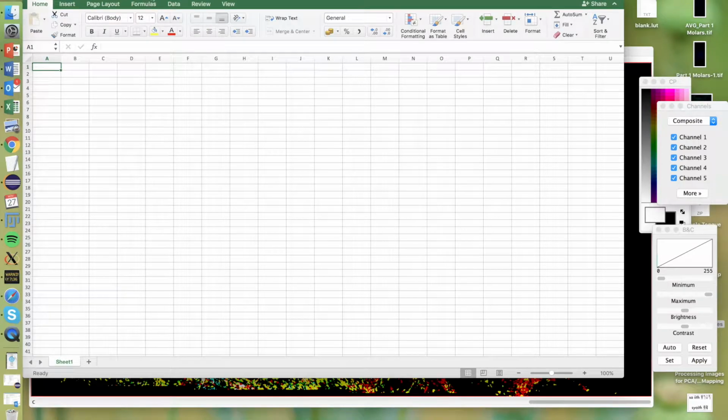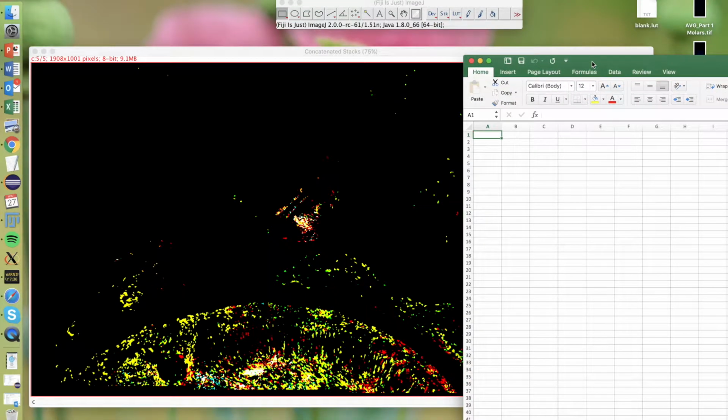and it's usually good to just have this in an Excel spreadsheet. So I'm not going to give these good names because I don't know them off my heart, but we'll go for surface muscle. We'll go for the vertical fibers. We'll go for the ventral muscle, whatever, and hyoid, I think. Doesn't really matter too much for this purpose.